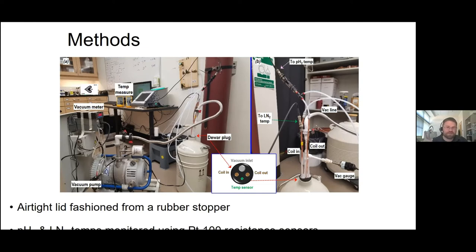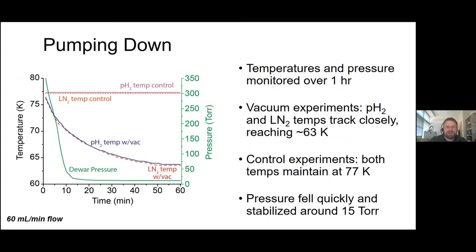We were interested in looking at the pressure inside, so we have a vacuum gauge to monitor the pressure. We were also interested in monitoring the temperature, so the fourth hole was to allow us to feed through a thermocouple to directly measure the temperature of the liquid nitrogen itself while we're pumping on it. Our second thermocouple, we threaded down into the parahydrogen generator coil through our copper tubing, so it rested a little bit above where we expect our iron hydroxide catalyst to reside.